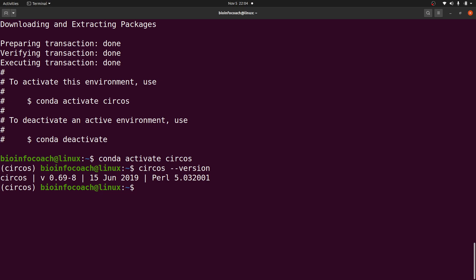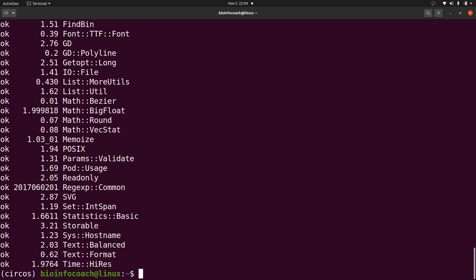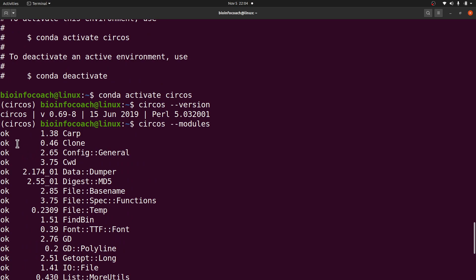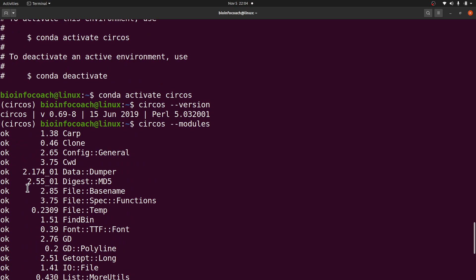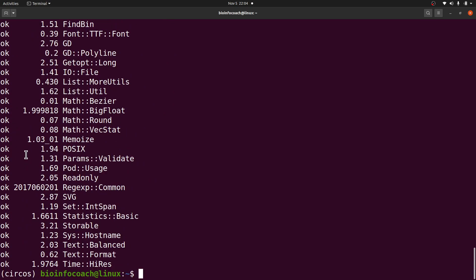There's also something else I want to check. Circos needs some Perl dependencies, so I want to check and make sure all these packages are installed. I'll say: circos --modules. This will list all the Perl packages, and as you can see they are all okay. So everything has been installed and we are ready to test Circos.